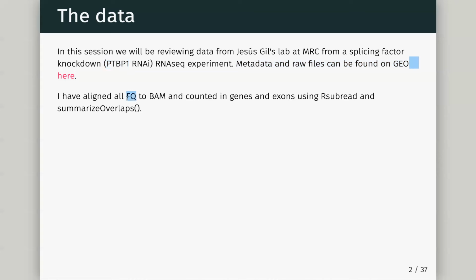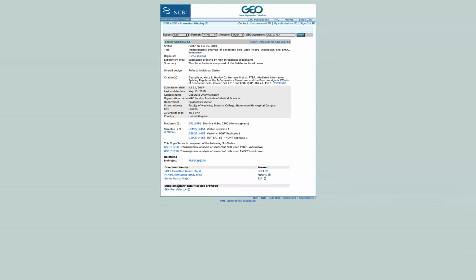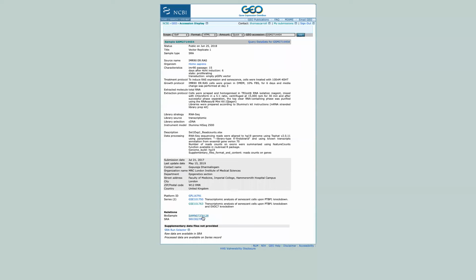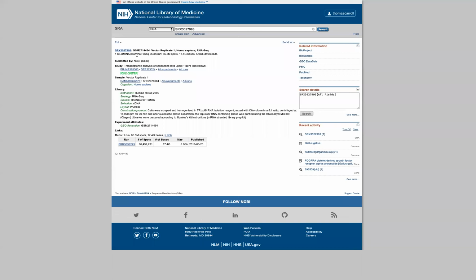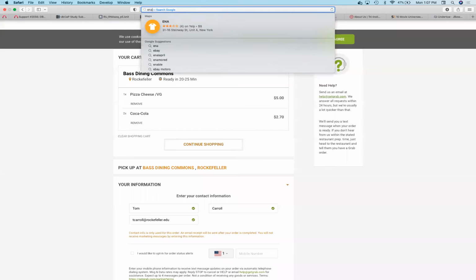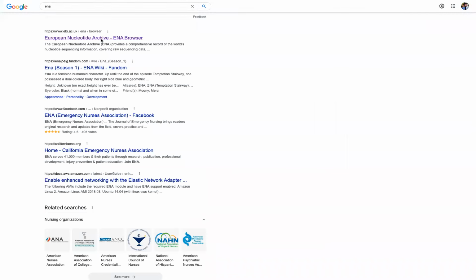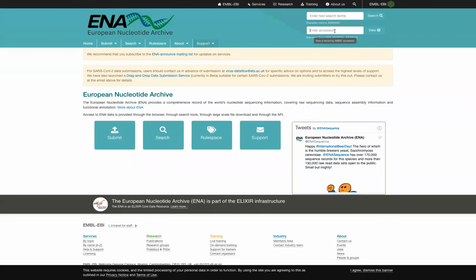So I've already done some of the work here, but if you went back to the original data, and remember on GEO, it's a little trickier to find, but perhaps we go to find the data here. We can pull out the SRA number. We can go to SRA. And from here, we can start to look at how we download the data. Personally, I prefer just to get this ID. And we go to, not necessarily grabbing food, but we'll go to ENA, European Nucleotide Archive. And we can always search our data there. It's going to be down, or no, we're up. Search session.